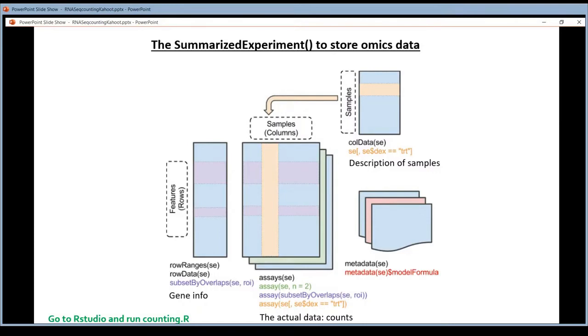You can have functional annotation, so gene IDs, Ensembl IDs, gene symbols, that kind of annotation. And you can also have positional annotation. So for every gene, where are the exons located? That's positional annotation. All these annotations are stored in data frames.